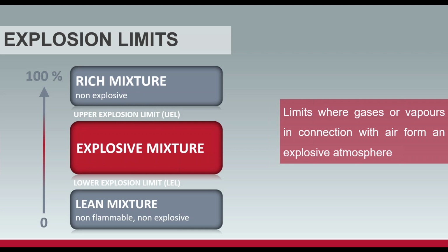But really what we saw is an example of lean mixtures, right? Something that's below an explosive. It's not a flammable. That's the 1 drop in the 500 mils. Then we get into the LEL, the lower explosion limit of a chemical. And unfortunately, that 5 drop scenario covered somewhat of the LEL, but on some chemicals, that LEL all the way up to the upper explosion limit can be very catastrophic, create just terrible explosions under a minimal ignition source.